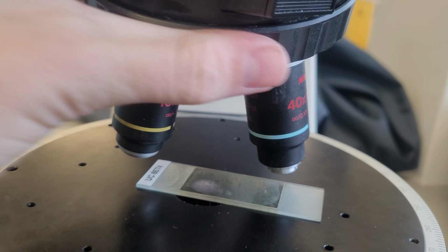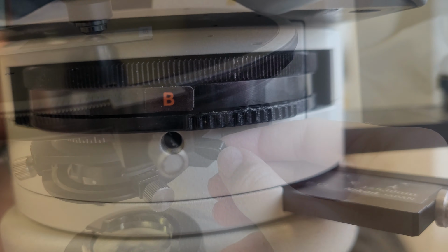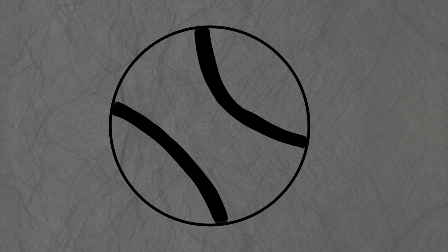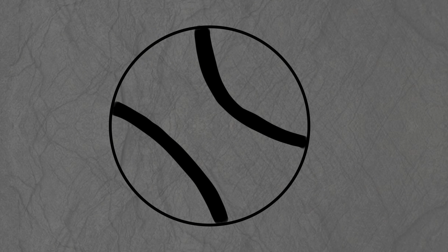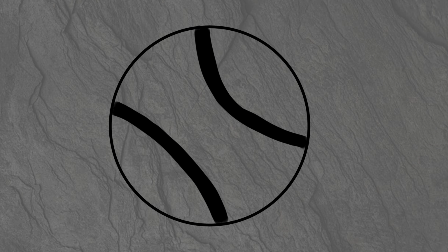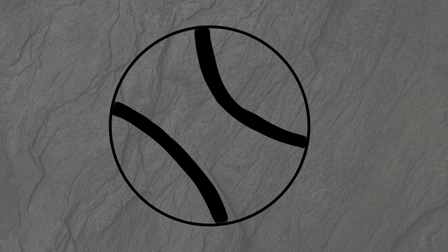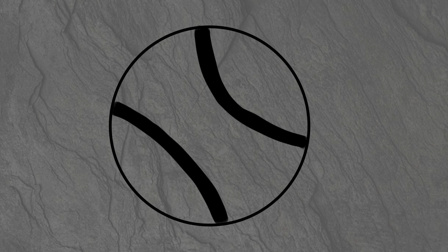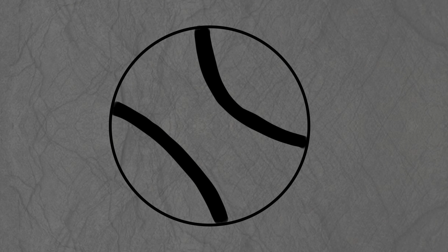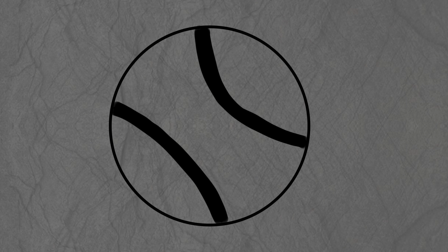Just like with uniaxial minerals, insert the Bertrand and condensing lens with the 40x objective lens in XPL while centered on the target grain to find the interference figure. This time we'll be looking for the acute bisectrix, or BXA, interference figure, which is cut perpendicular to the acute bisectrix. Again, there's two isogyres, which actually come together and move apart as you rotate the stage. These isogyres are curved, and there's two melatopes where the optic axes emerge at the corner of each isogyre.